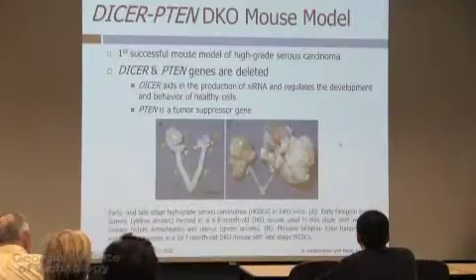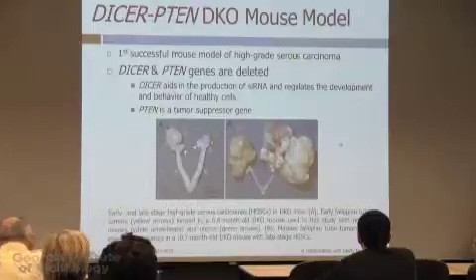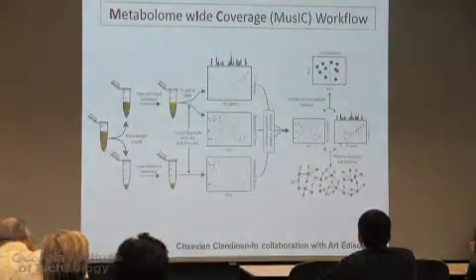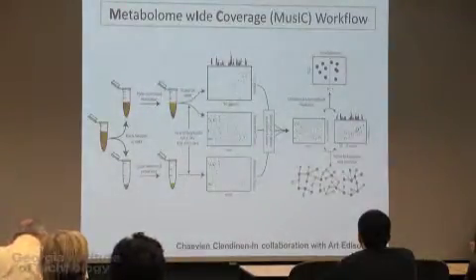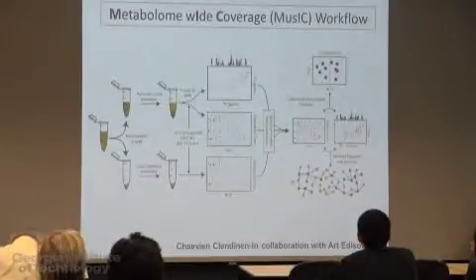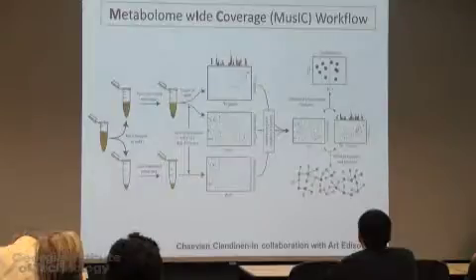It mimics many of the molecular features of human ovarian cancer. For example, these mice have elevated CA-125 and many other features that you would see in humans. So as far as we know, it's an adequate representation of what you would see in human patients. So what we set to do is a metabolomic investigation. We said, okay, is there any alteration in blood from these mice at the very early stage of disease? Is there anything that we can detect that's going up or down that will be a good indicator of disease?